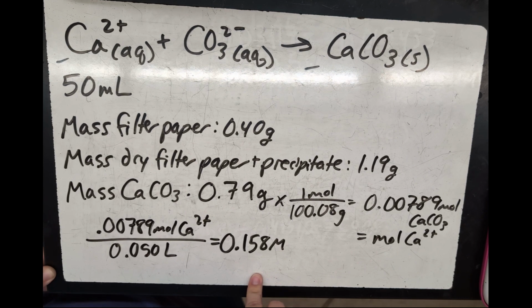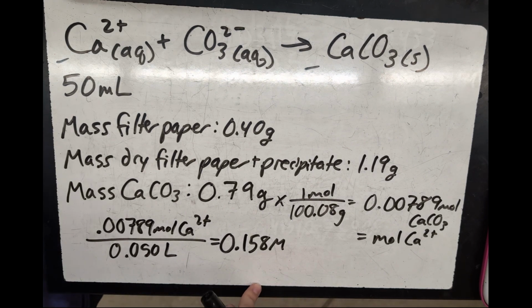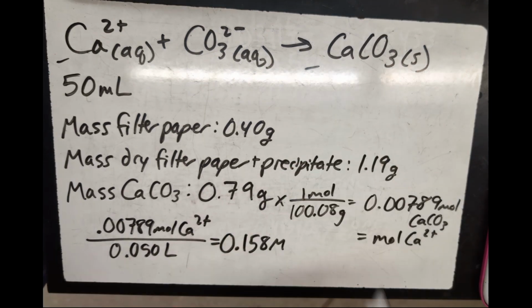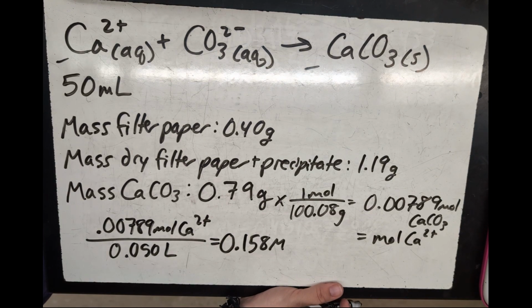But yeah, really good experiment. There are lots of other possible precipitation reactions you could do, but this one opens up for a lot of good discussions. And calcium carbonate shows up in a lot of different experiments, so it's good to give kids the exposure to that compound.